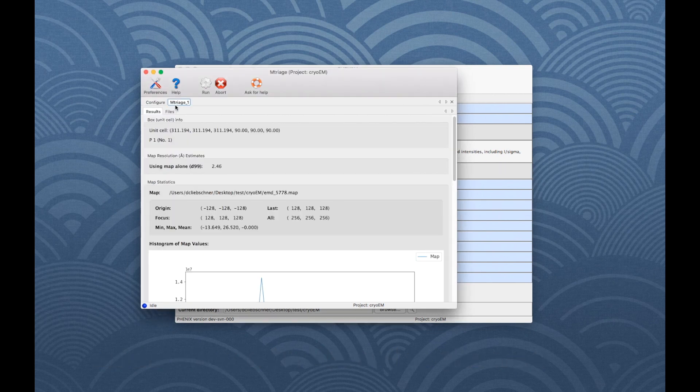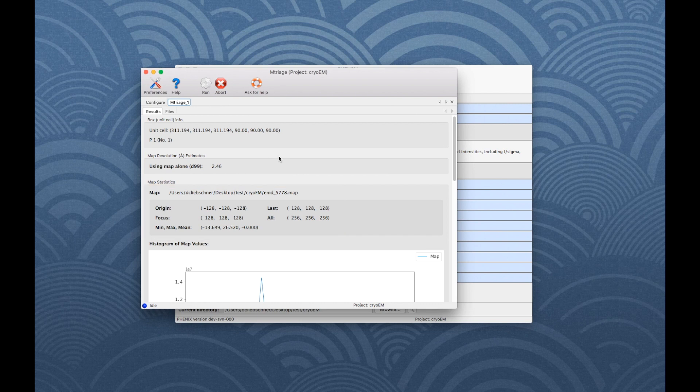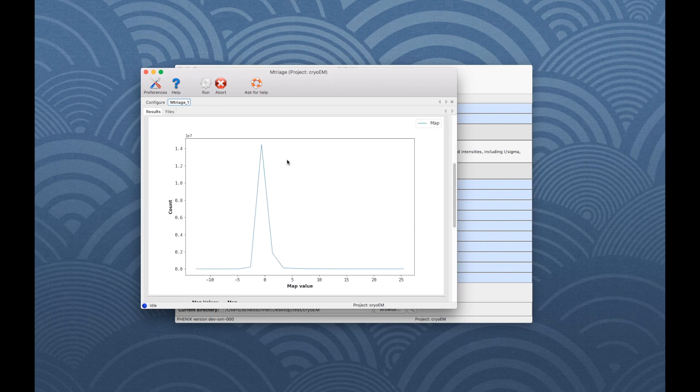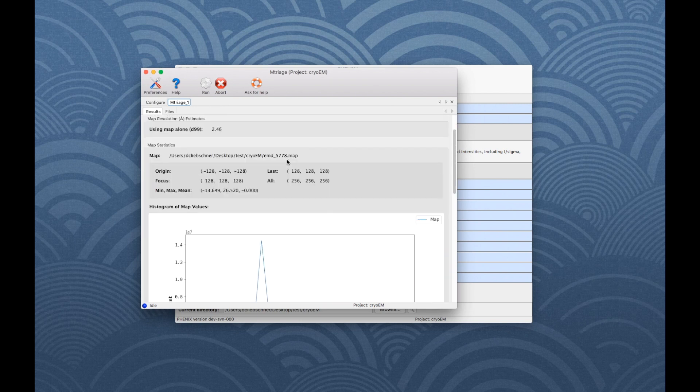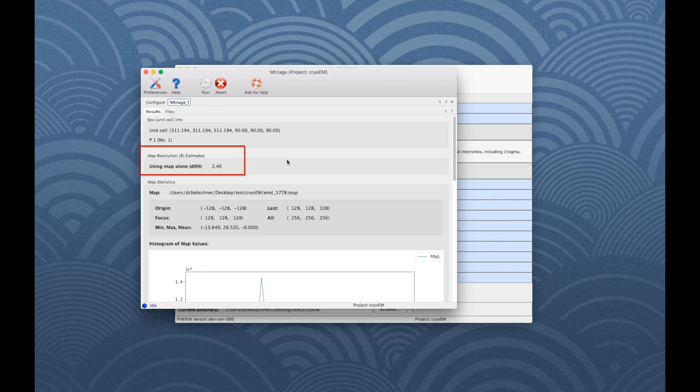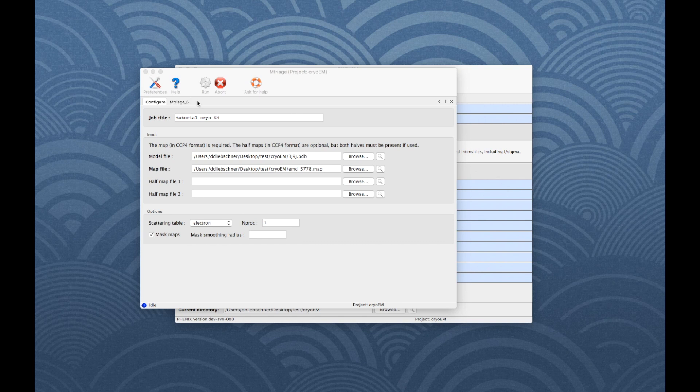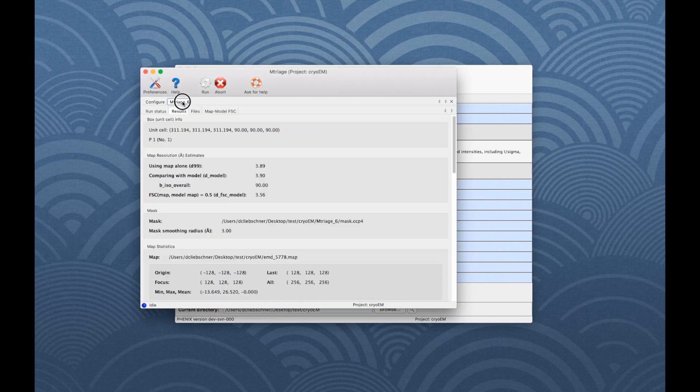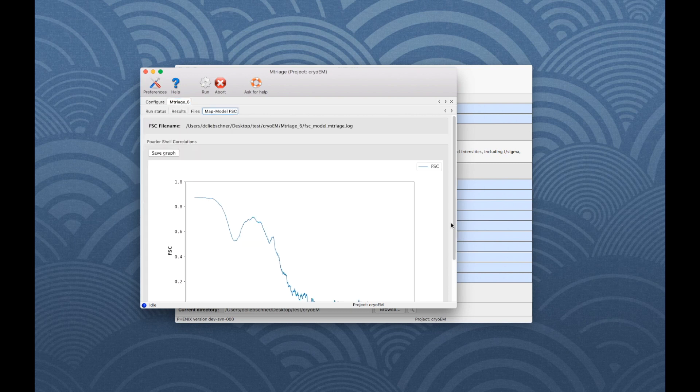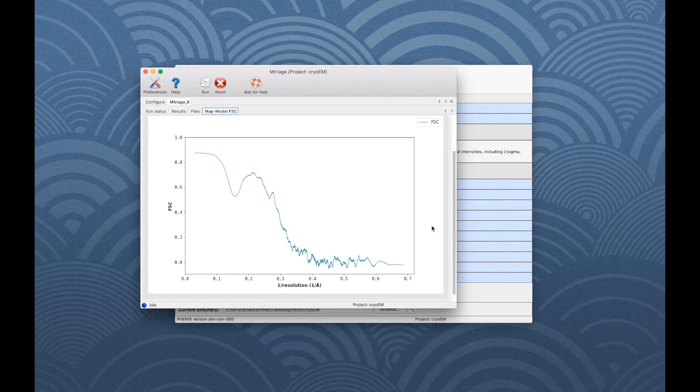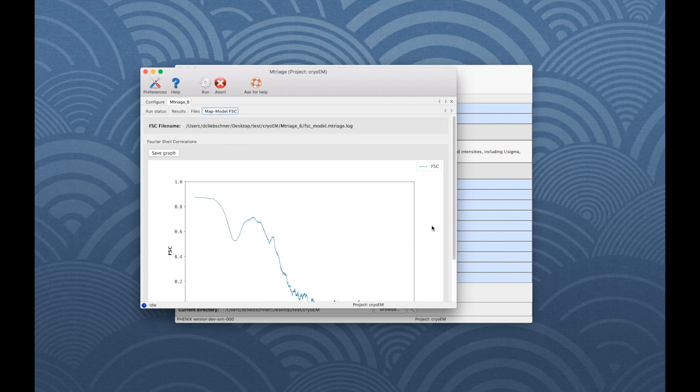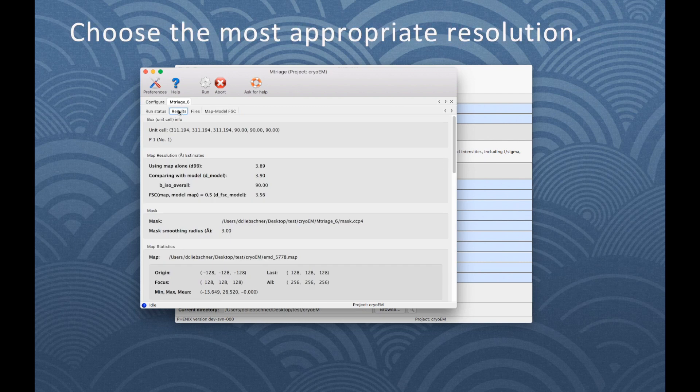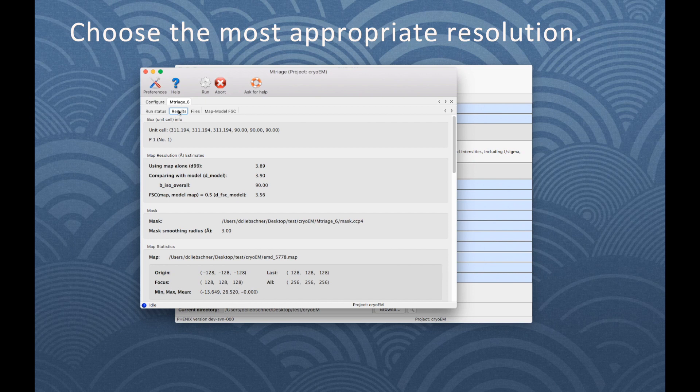The Result tab shows map statistics, a histogram of map values and an estimate of the resolution. If a model was provided, there are additional resolution estimates and the MapModel FSC tab shows a plot of the Fourier shell correlation. It is recommended to compare the resolution estimate from mTriage to the one obtained from Data Processing and choose the resolution which is the most representative of the map.